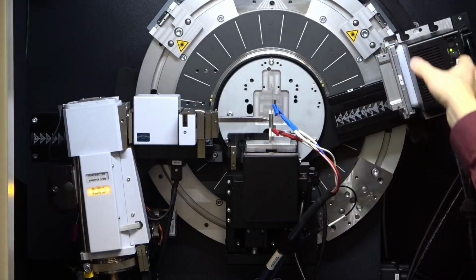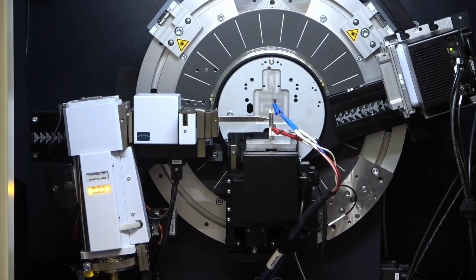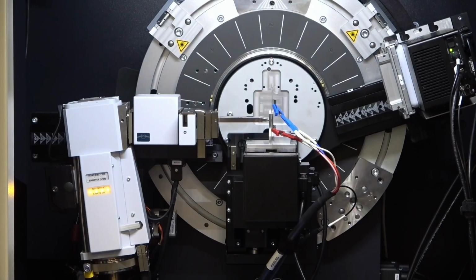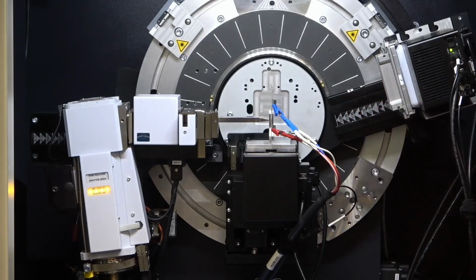And on the secondary side, I'm using an Eiger 2D detector to catch a large 2 theta range. We will be using it in a 1D mode to collect snapshots. This allows me to catch up to 20 degrees 2 theta in this configuration, but I can flexibly change the position of the detector, put it further away for more resolution, or put it closer to the sample to gain more 2 theta range.